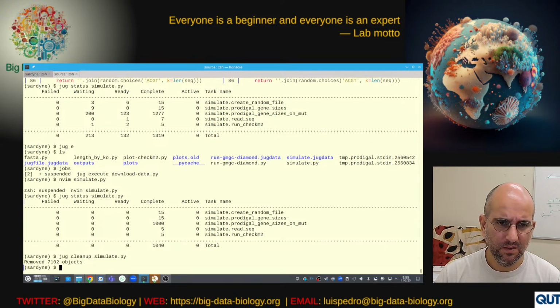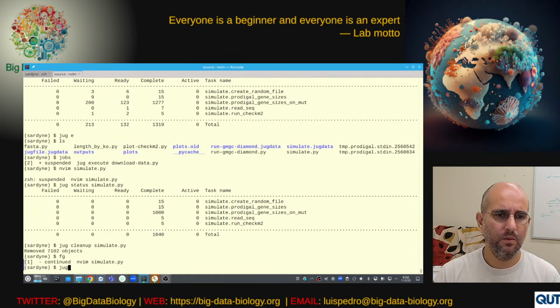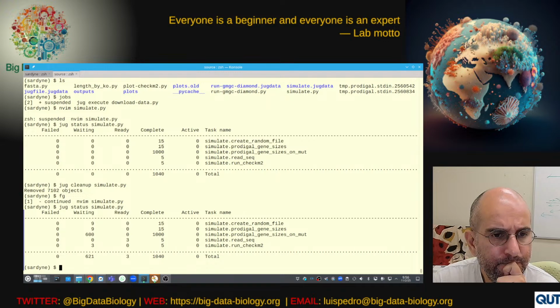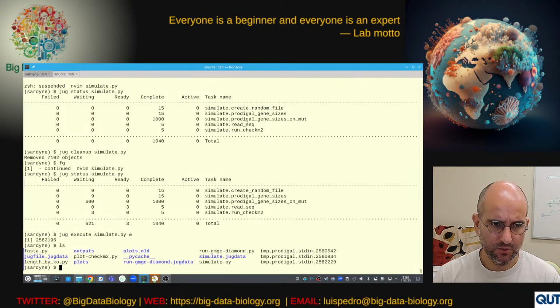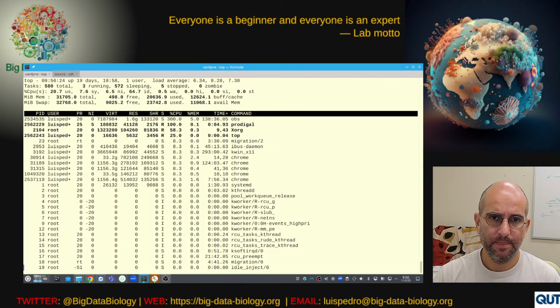I'm going to clean up. So anything that was outside of that specification is gone, and right, and now we execute, and it should run. Okay, the protocol's running.